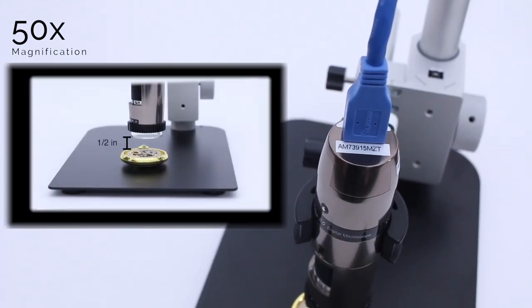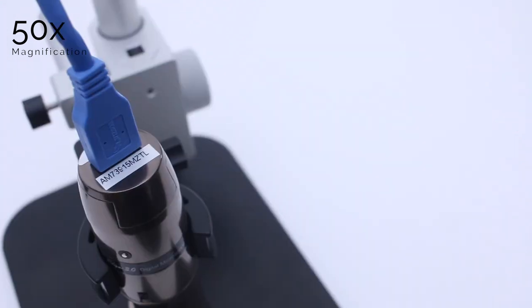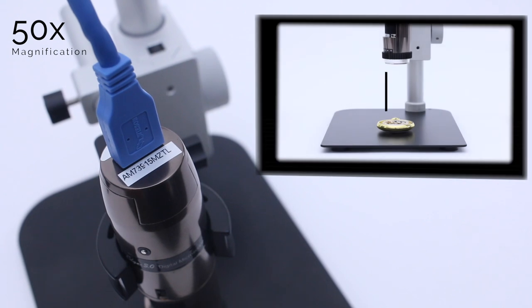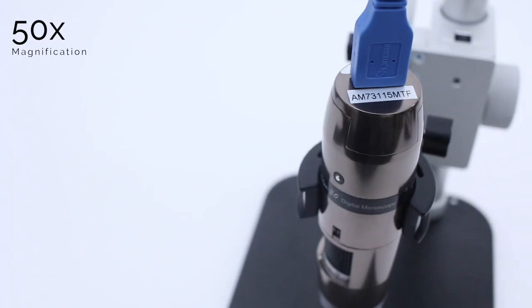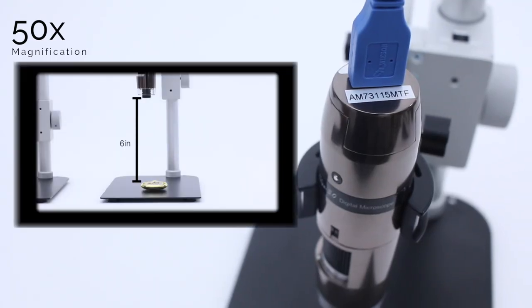Over here is our standard distance model. It's nearly touching the subject. This one is our long working distance model at 50x and it's about two inches away from the subject. Over here is our far working distance model at 50x and it's over six inches away from the subject.